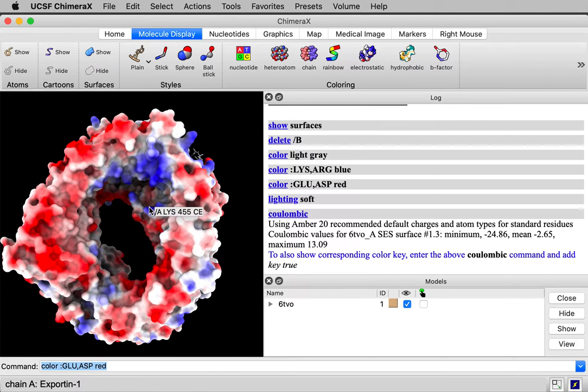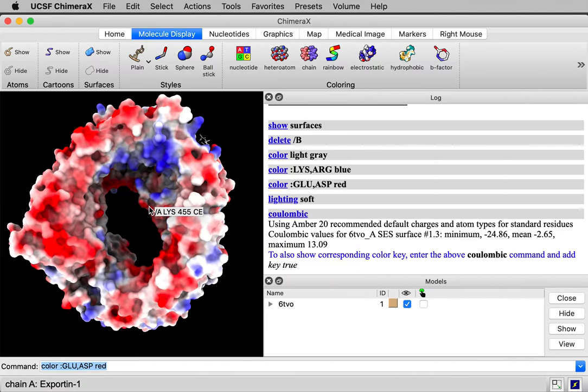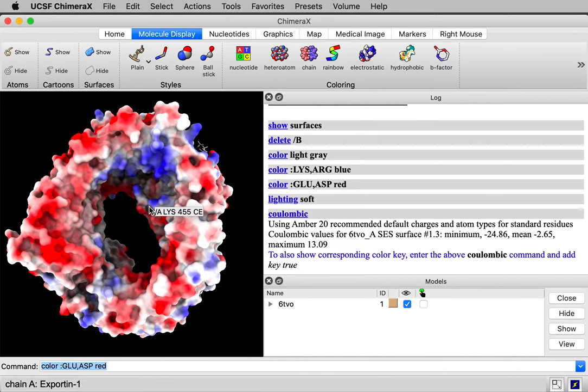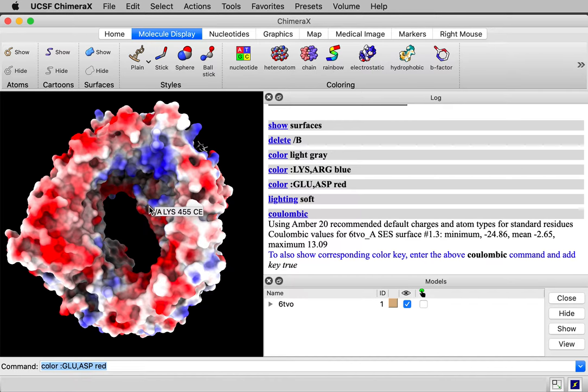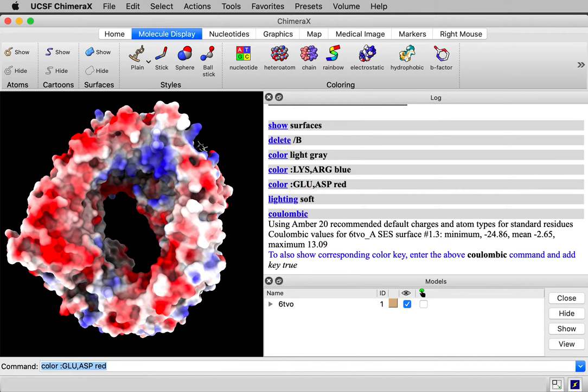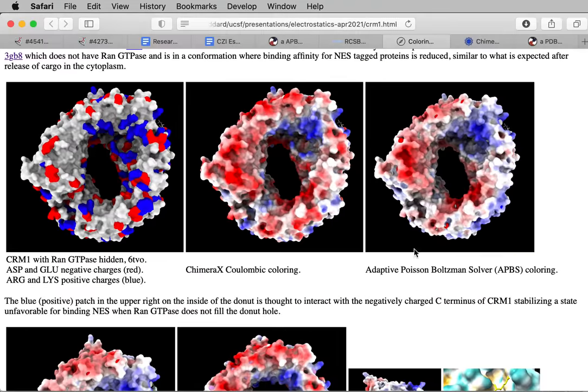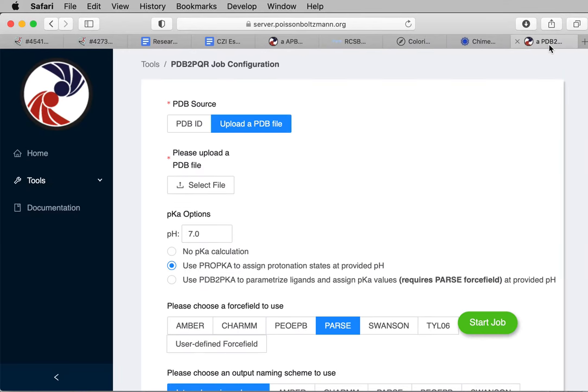This Coulombic calculation is a little simplistic in handling the polarizability. A fancier, more physically correct way is done by a program called APBS, Adaptive Poisson-Boltzmann Solver. ChimeraX doesn't have this built into it right now, so I used a web server to run APBS. Let me show you that server.